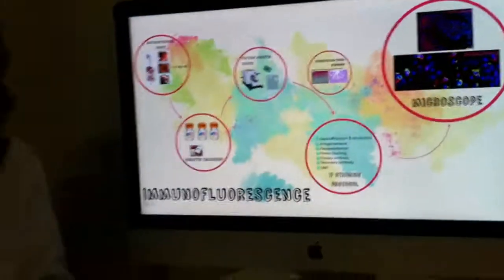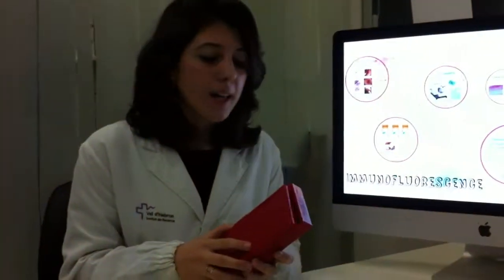To store the slides, we recommend a dark box like this, and only a few days in the fridge. But if you want to maintain the fluorescence better and longer, we recommend storing them at minus 20 degrees.